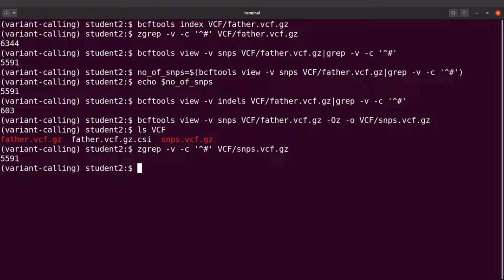Aside from filtering using the variant type, you can also filter using other criteria such as quality, chromosome position, chromosome number, etc. So we are going to look at a few examples here. To filter, there is a command that can be used. That command allows you to specify an expression. So to filter a VCF, we use BCFTOOLS filter. Then we can give our expression. But before we continue, let's go to the BCFTOOLS page and look at how the BCFTOOLS filter command is used.